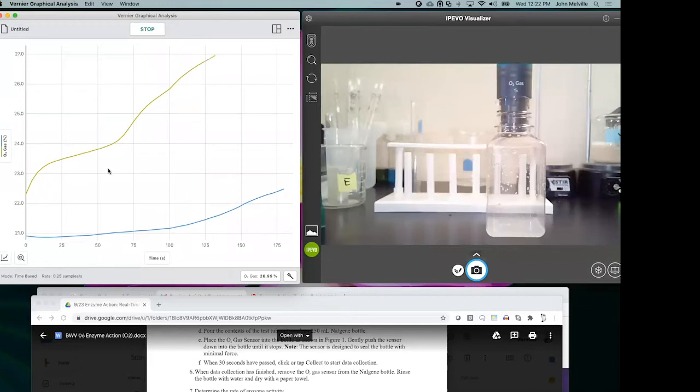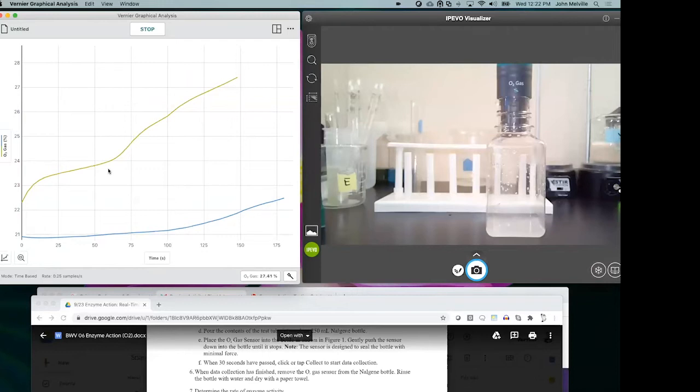So what I would do next is the version of this activity that uses the inquiry lab preparation, which is slightly different. In our inquiry biology book, we put it on a stir station. We use 10 mils, and I'm going to use an enzyme suspension of catalase that I've made. You'll see that the response is much cleaner as it starts off. But in this case, if you grab the response from the last 100 seconds and compare those two slopes, they're going to be very different.